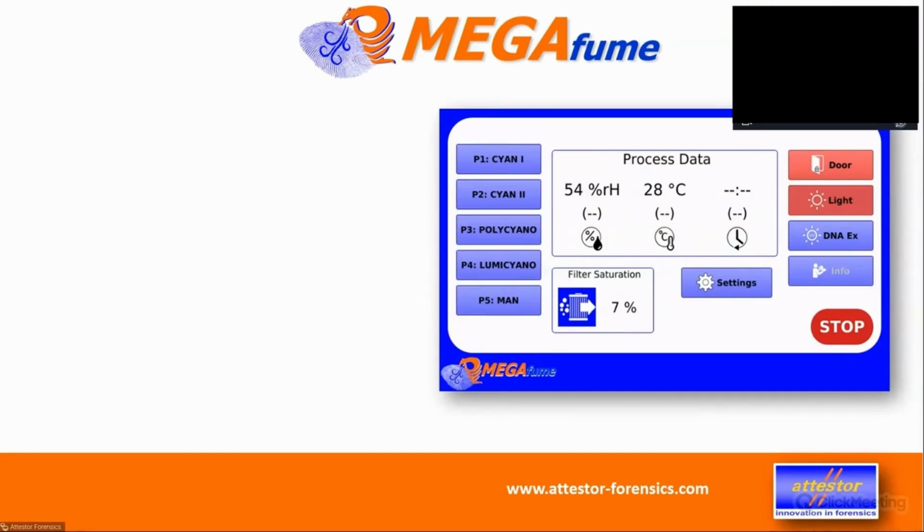The cycle counter will, though, have to consider the worst-case scenario. So it will count back based on the 5 grams you put in there. Let's do a calculation. I'm really bad at counting in my brain. If we say we usually use 0.5 grams, but the counter is actually working with 5 grams, that means in theory I could do approximately 10 times the runs and still would not oversaturate the filter.